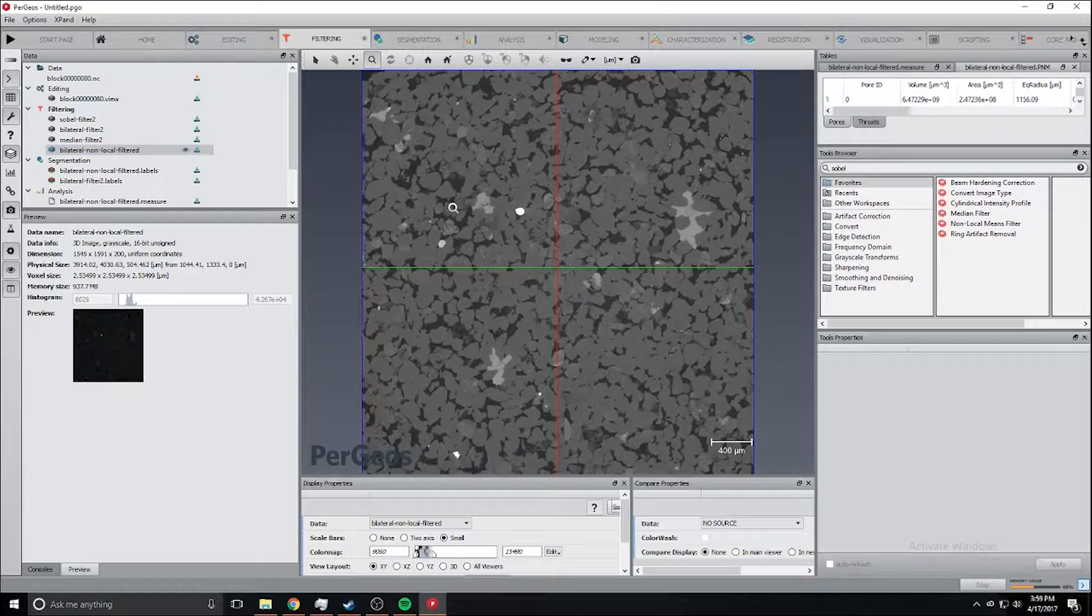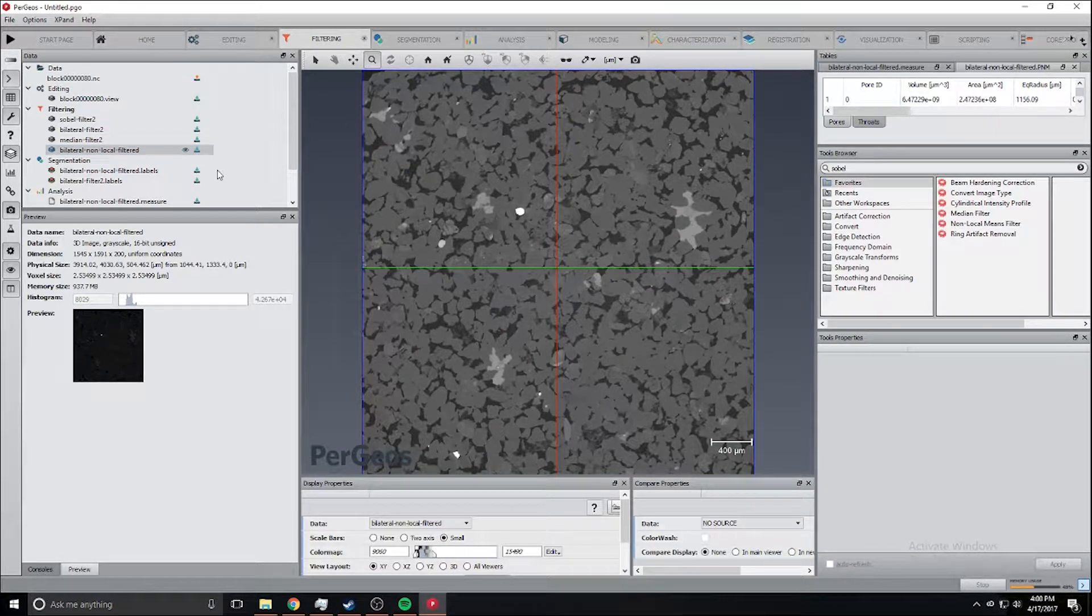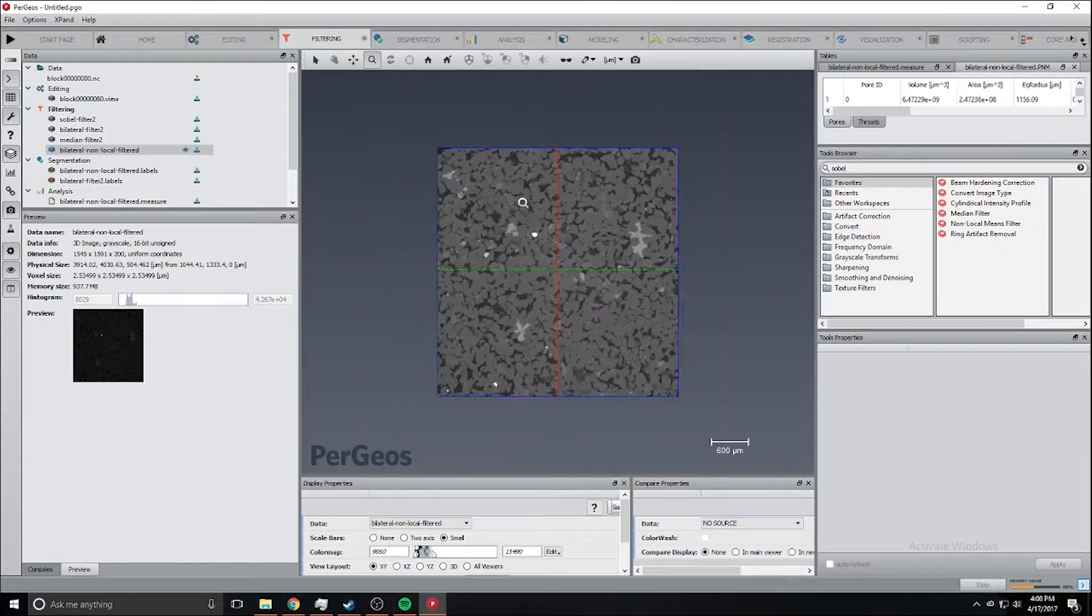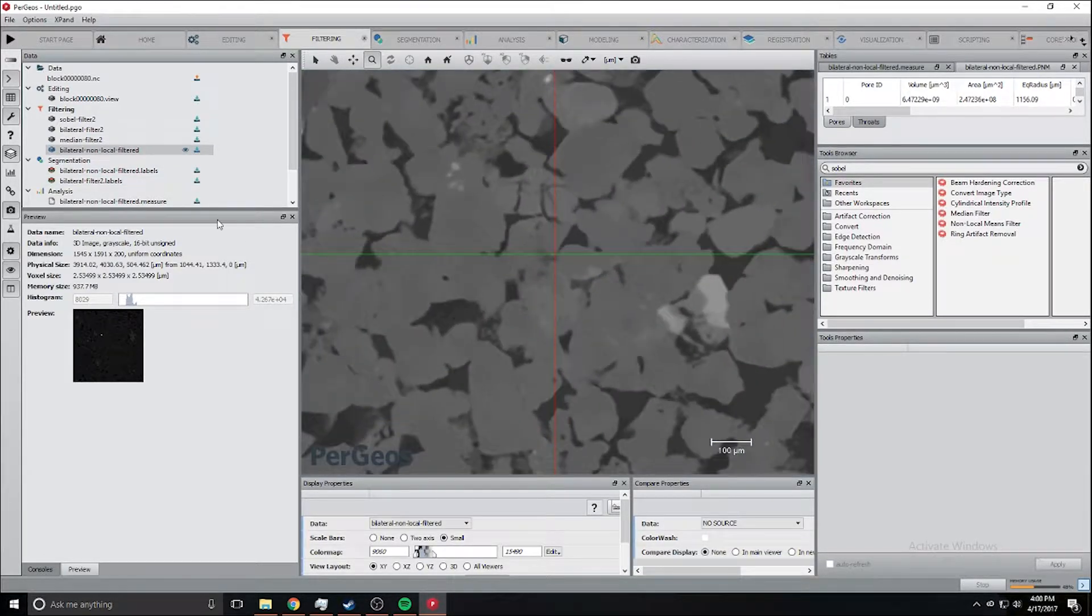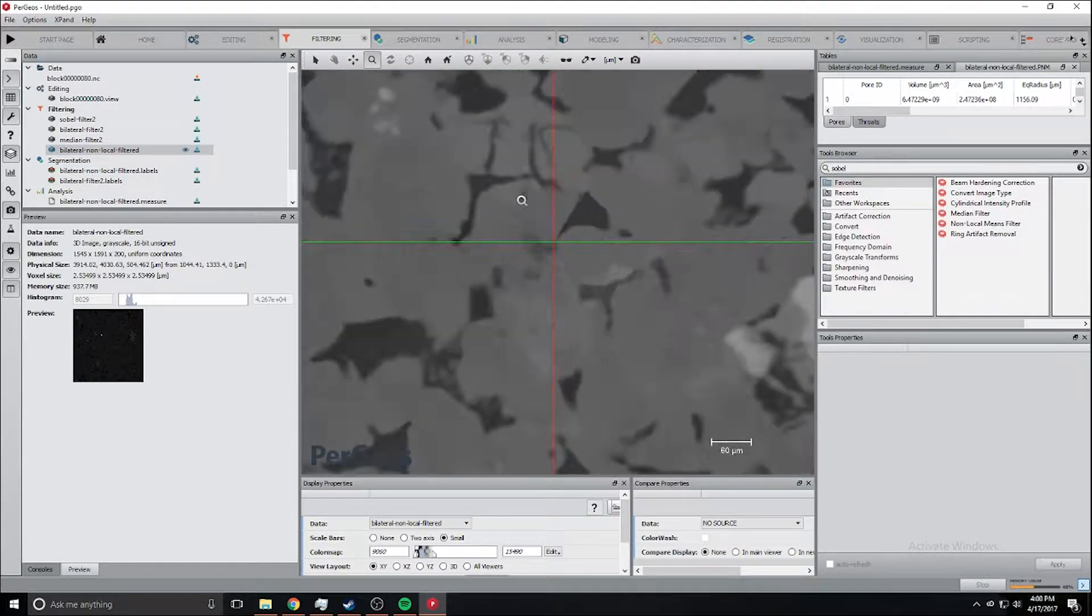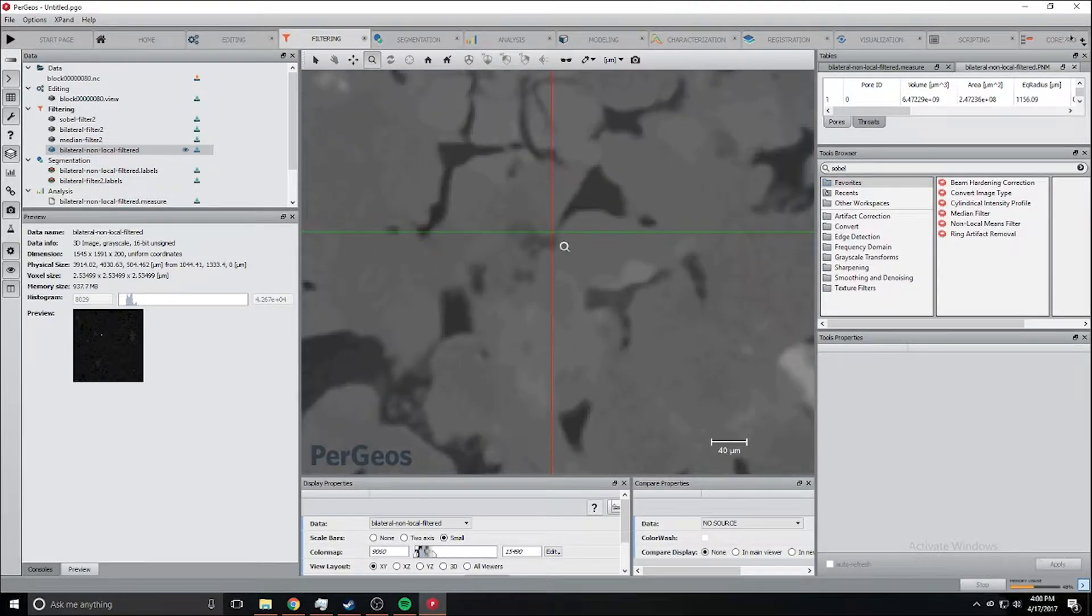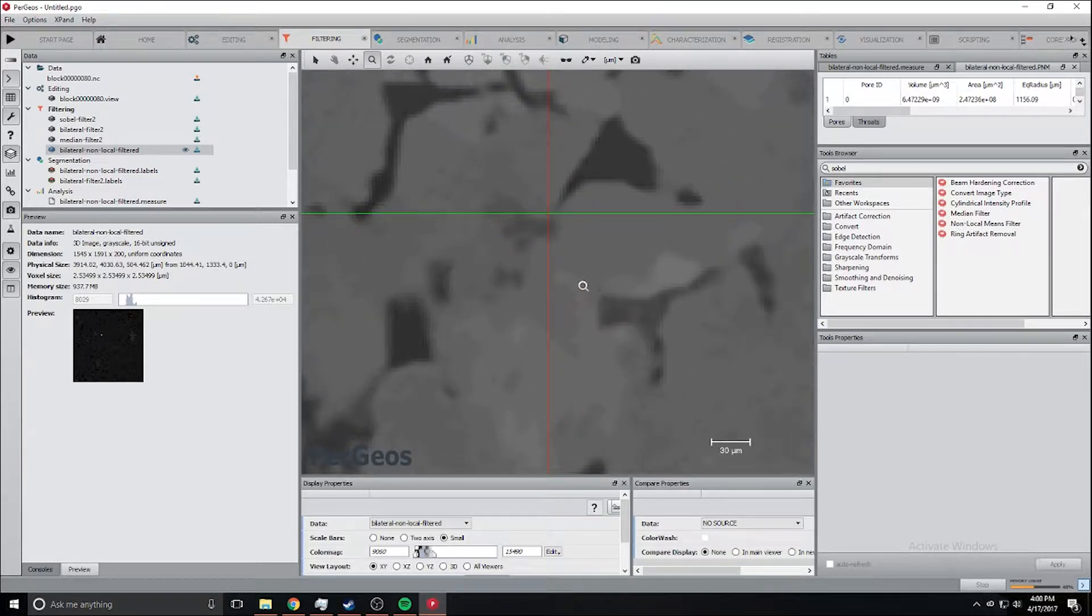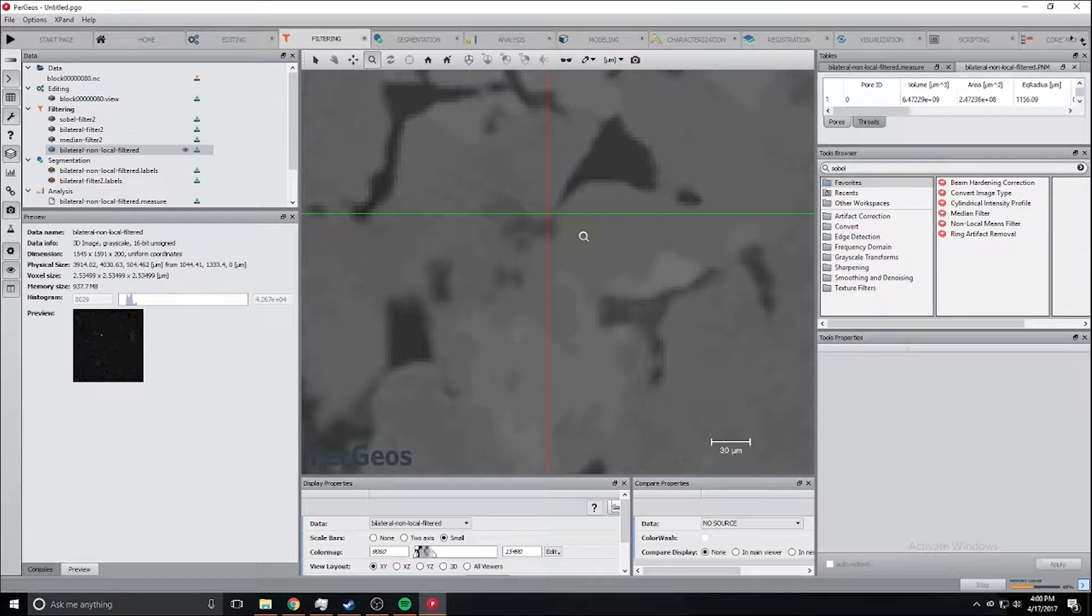If you don't have a much more powerful GPU you might just want to use the median filter instead. Now that we have that you can see they're all grouped together.